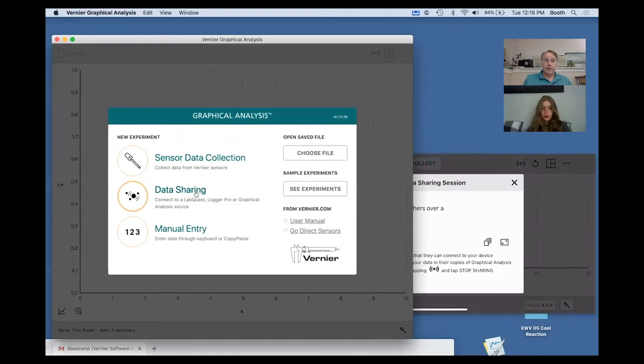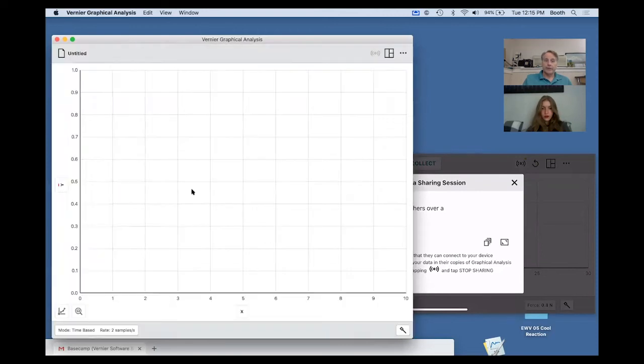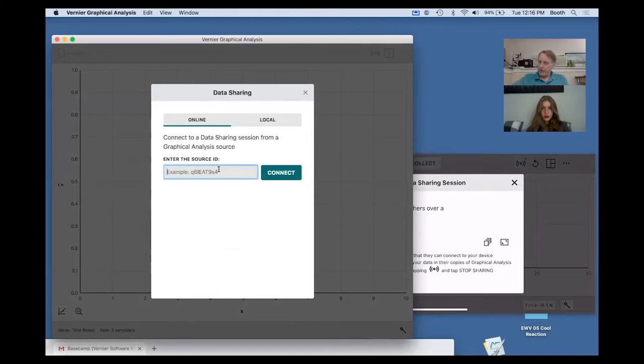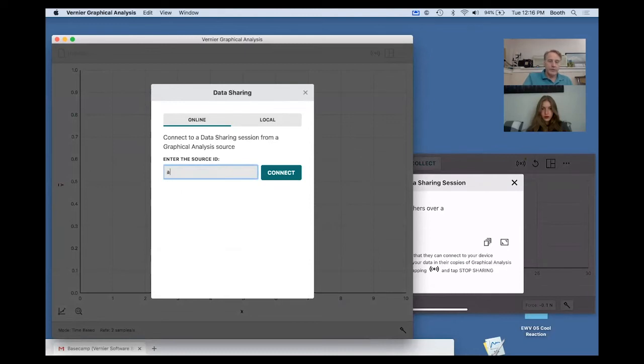I'm going to go to data sharing, and this is where I need to type in that code. So I'm going to type it in: A, B, C, okay, so I'm typing in the code.